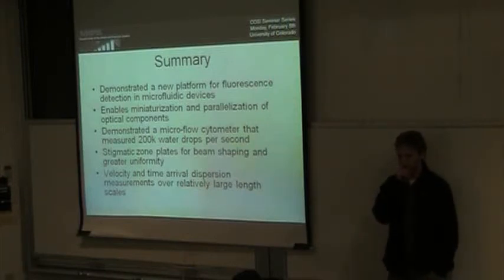So how hard is it? Tell us how to do it. Several out of 1,000 don't come out. Yeah, PDMS is this amazing material that wets the surface and is able to dig itself into any trench. And then it's actually very simple. You just mix this PDMS with 10% of the curing agent.